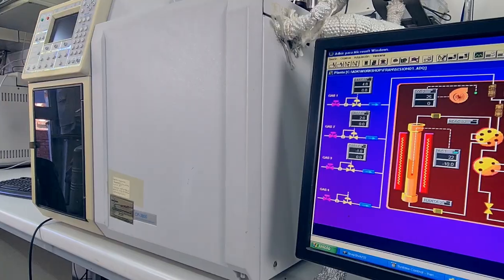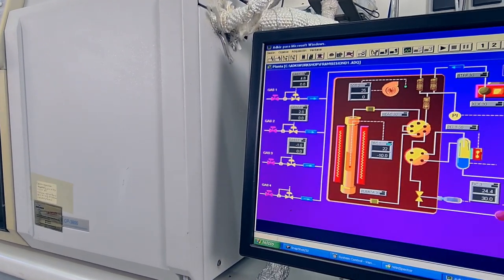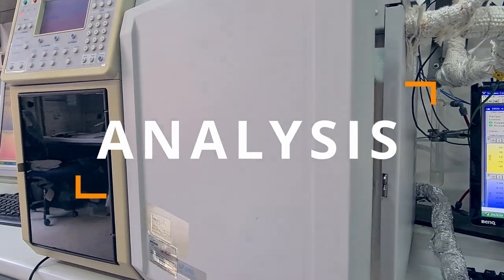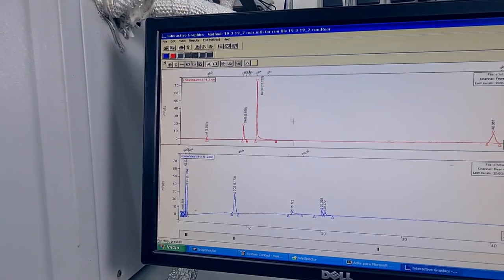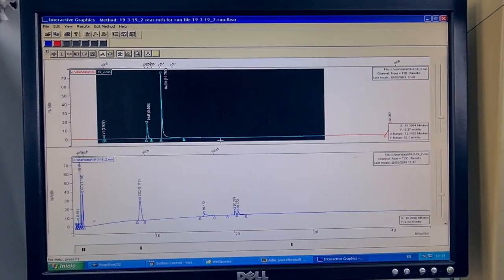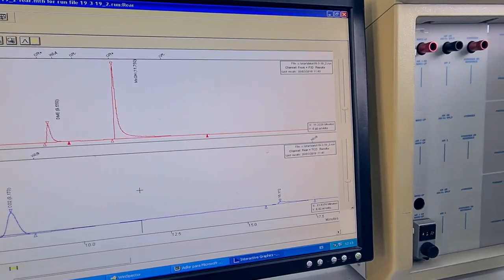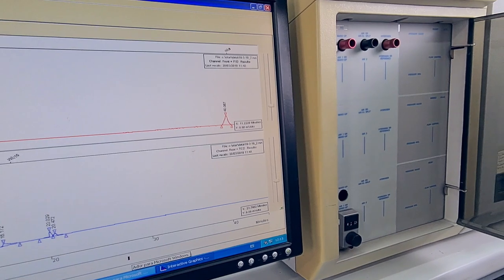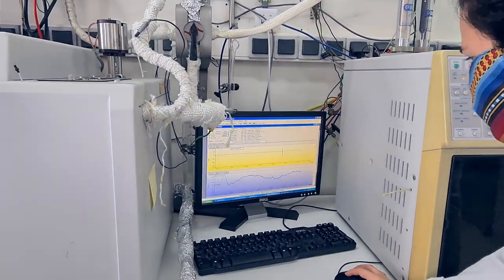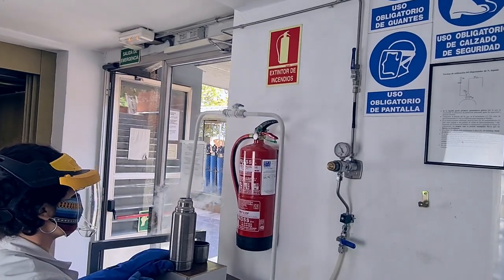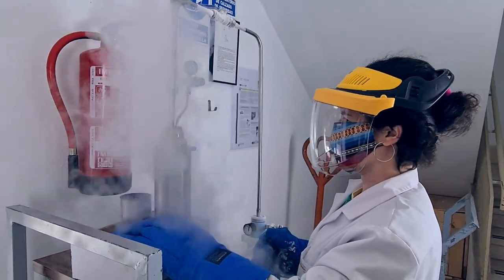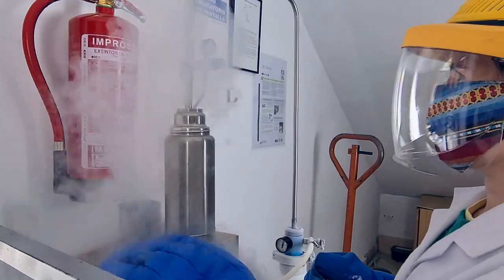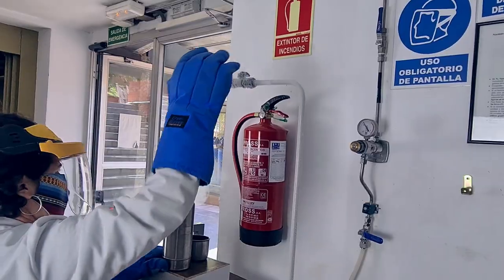We use gas chromatography to analyse the composition of the outlet stream of the reactors. This technique allows separating the different compounds of a mixture, and we use the detectors installed in the chromatographs at the end of the columns to quantify the CO, CO2, methanol, and DME in the samples. In the collected chromatograms, we observe separated peaks which correspond to each compound, and the area under the curve of these peaks is representative of the concentration of the compound in the mixture. The degree of separation depends on the temperature of the columns, and when effective separation is not possible at room temperature, we can introduce liquid nitrogen to refrigerate the columns and improve the resolution of the peaks.